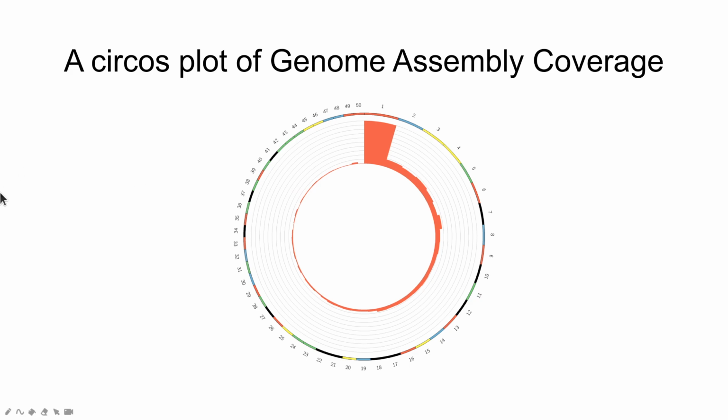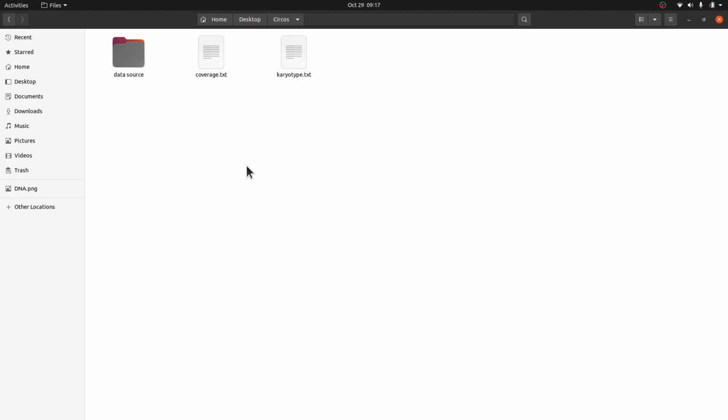So let's get back, and then let's open a text file. Now these are normal text files, so you can use your text editor, but I would prefer to use the command line. That's what I will do because that one is comparatively faster for me. All right, so I will open my terminal now.